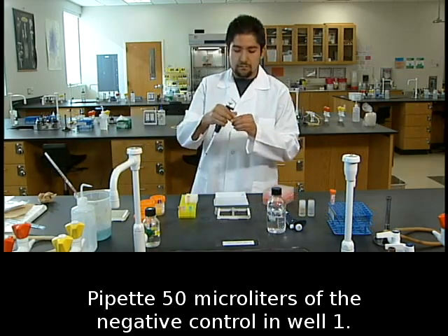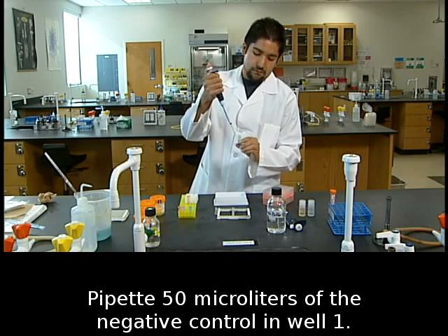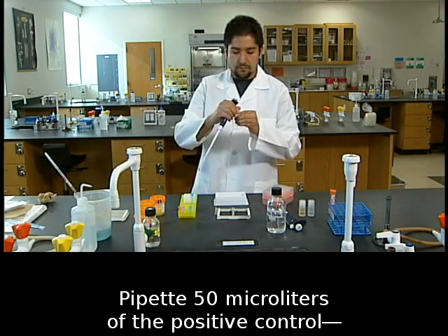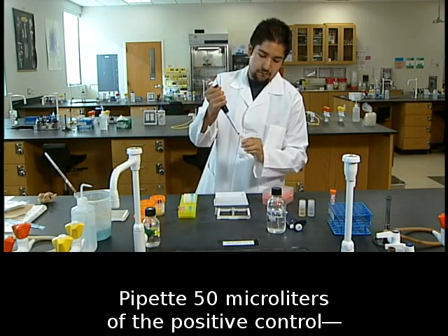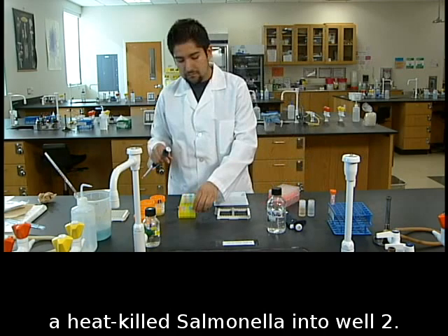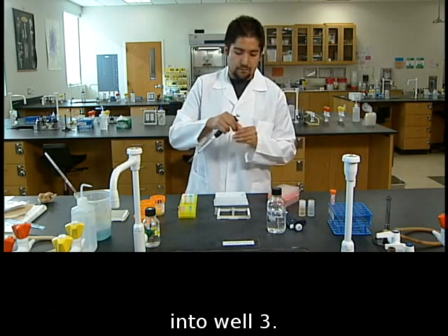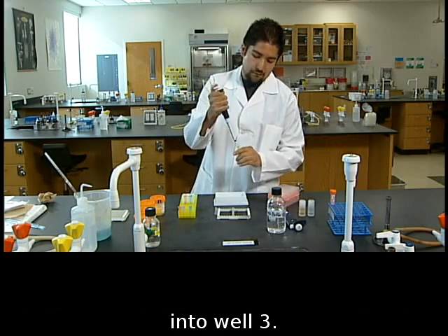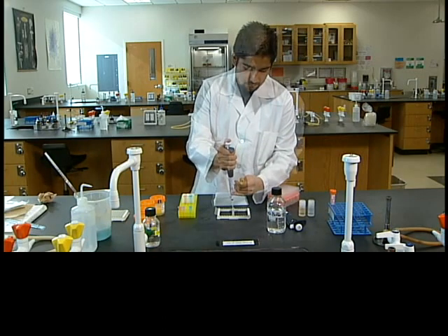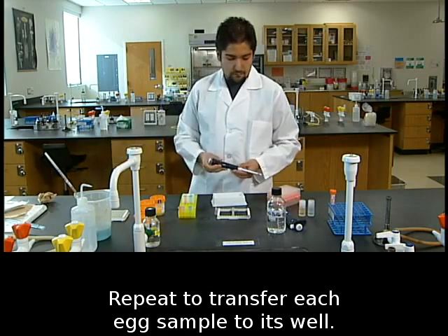Pipette 50 microliters of the negative control in well 1. Pipette 50 microliters of the positive control, a heat-killed salmonella, into well 2. Pipette 50 microliters of the first egg sample into well 3. Repeat to transfer each egg sample to its well.